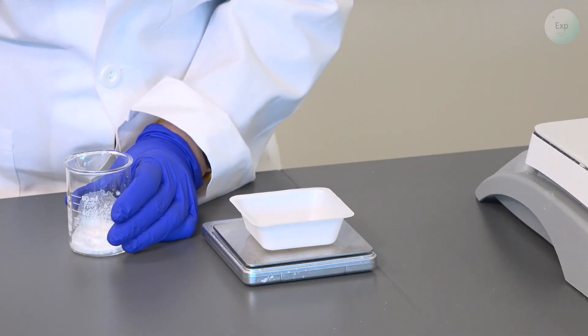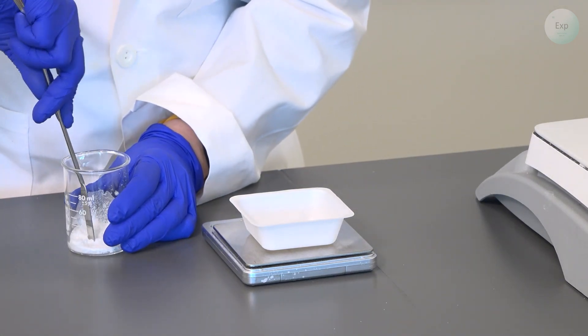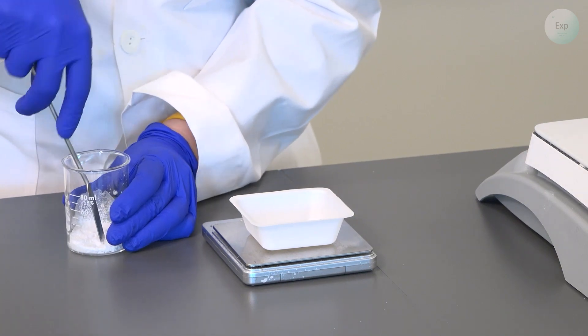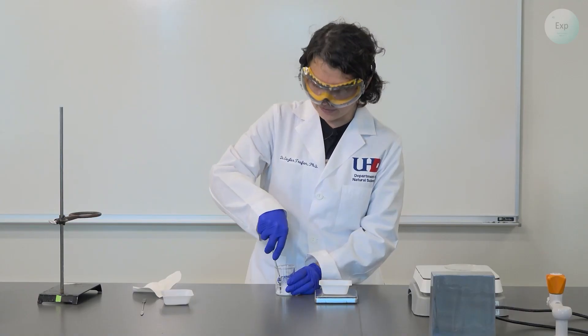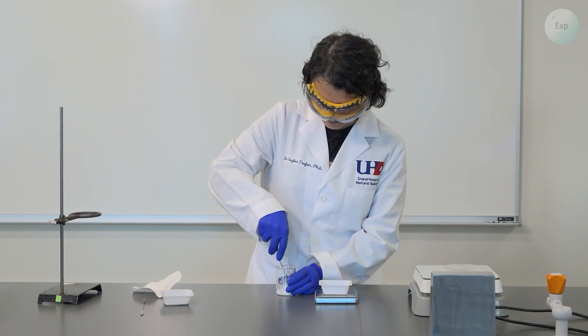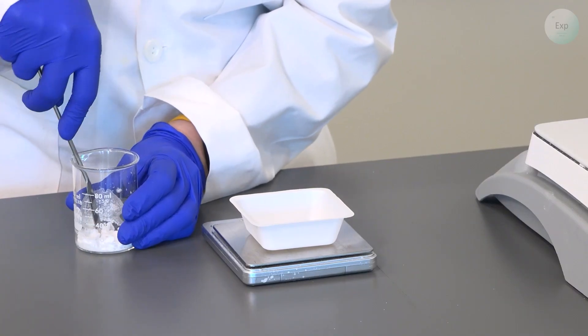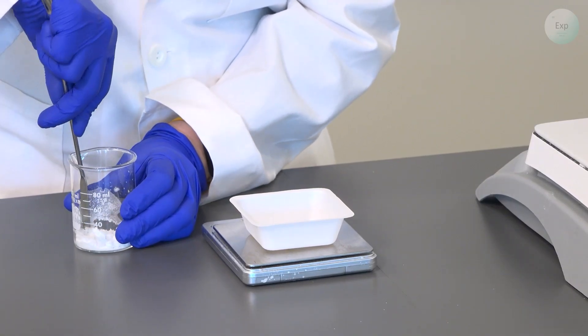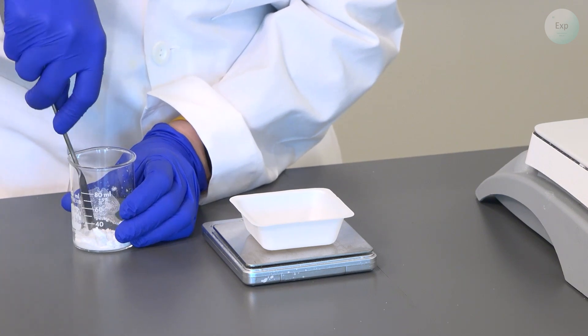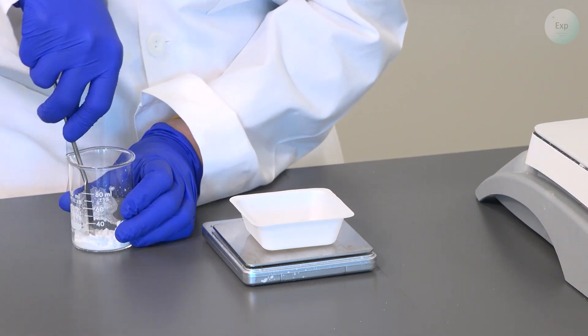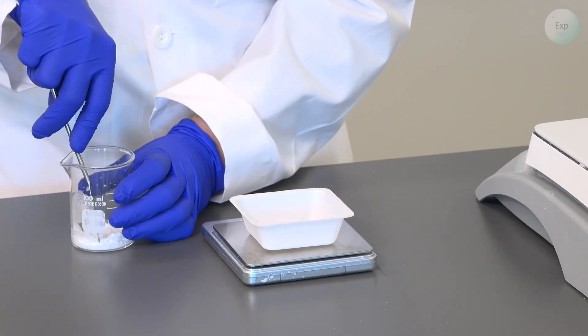Next, when the beaker is cold enough to work with, we're going to scrape out the salt from within. We have to be somewhat gentle because the beaker is made of glass and it is relatively easy to break glass.